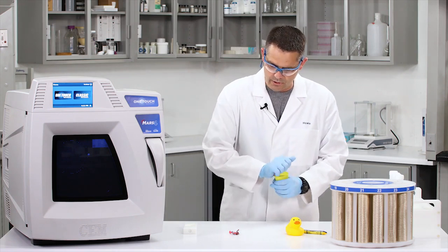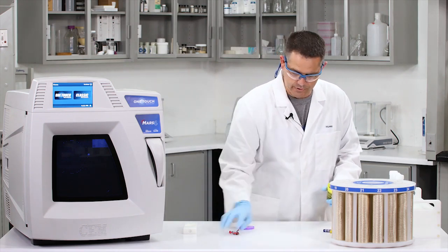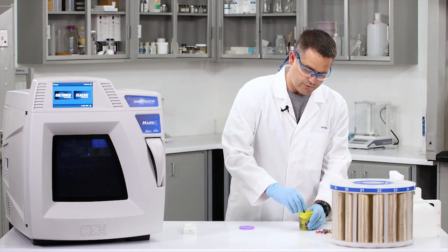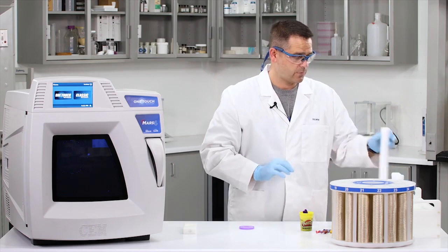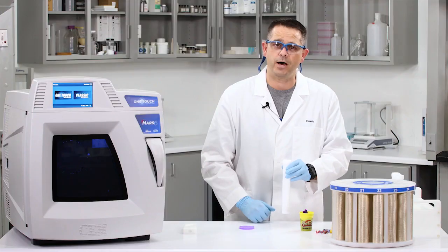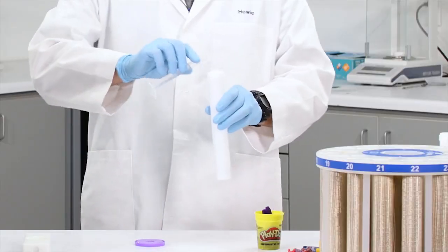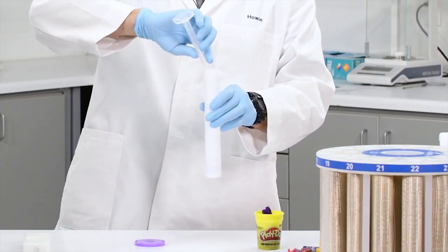So as I said earlier, we're not going to have to do anything special with Play-Doh. And once again, you've seen my video before. You know this is a calibrated eye. That is approximately 1/2 of a gram. We're going to drop it all the way to the bottom of our Express Plus vessel. And here we're going to add our 10 mils of nitric acid.